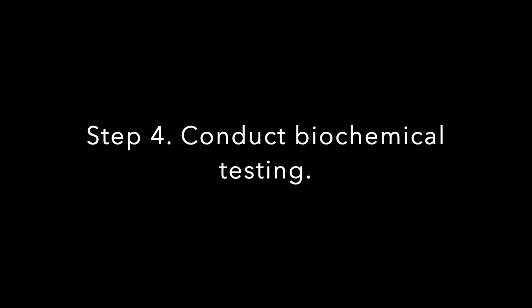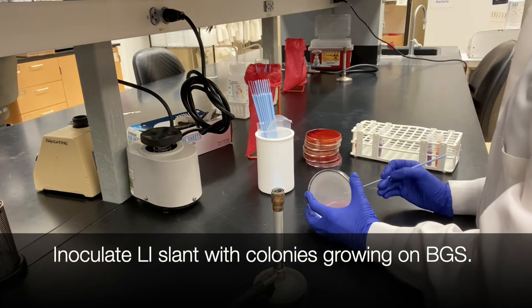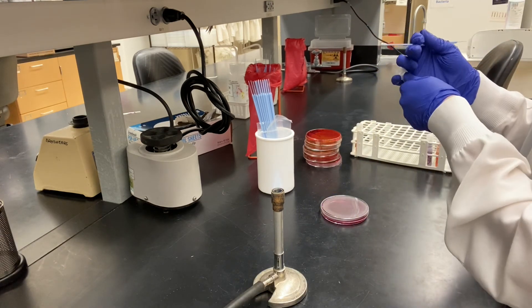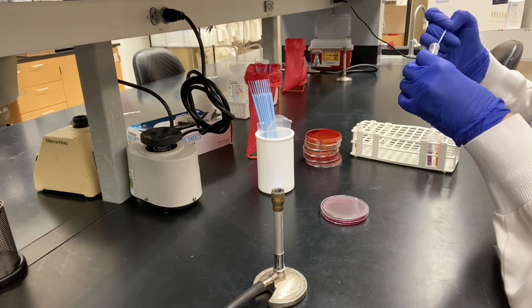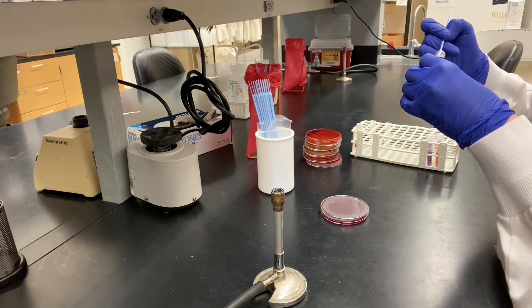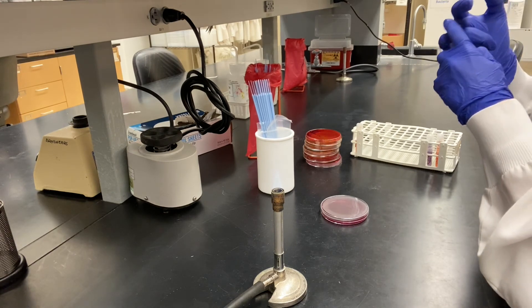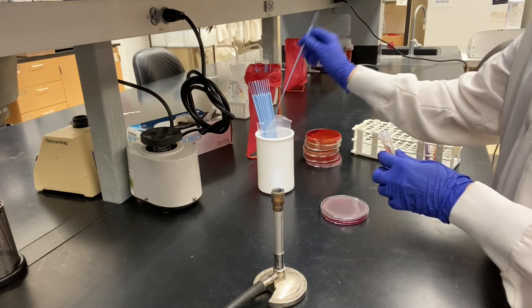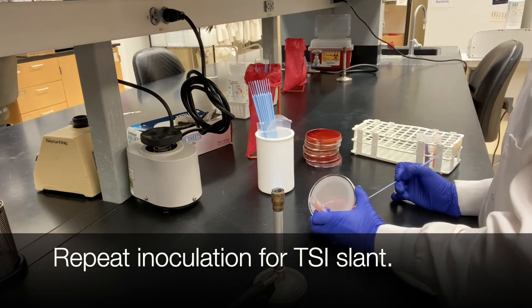Step four is to conduct biochemical testing. Inoculate your lysine iron or LI slant with colonies growing from the BGS agar plate. Repeat inoculation for your triple sugar iron or TSI slant.